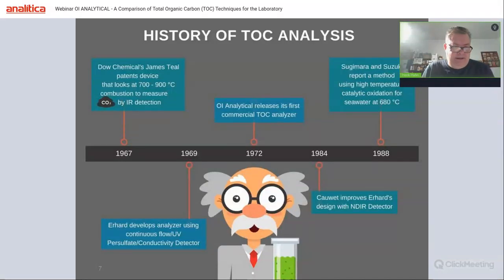And then in 1969, Earhart developed an analyzer using continuous flow UV persulfate conductivity detection.